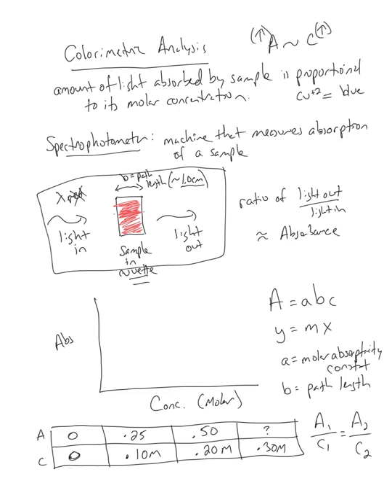The answer is no. A sample is red because of how it treats light, which contains all the wavelengths of white visible light, all the frequencies and wavelengths of the rainbow. A sample that is red, the reason why it appears red to our eyes is because it reflects red light and frequencies and wavelengths around the red spectrum the best. Because it reflects it, it really doesn't absorb it.